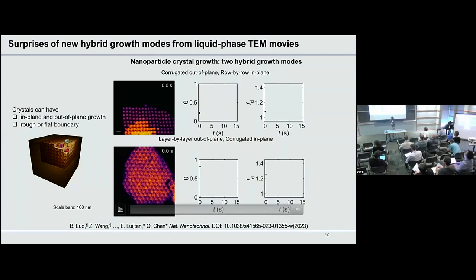Here we're utilizing the beautiful property that with different thickness, you will have different intensity of the signal. That's how we're able to tell, oh, this is the first layer, and those orangish colors are actually the second layer, and this yellowish color is the third layer. So we can still get decent tracking there. I also didn't talk about another of our recent works on a complicated three-dimensional lattice. In that case, we can also use machine learning to allow for single particle tracking.